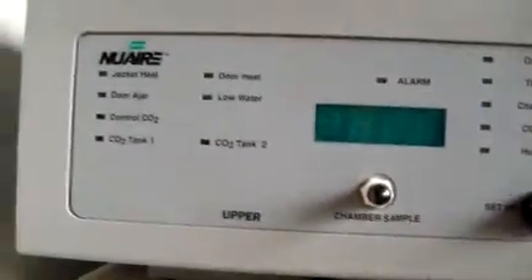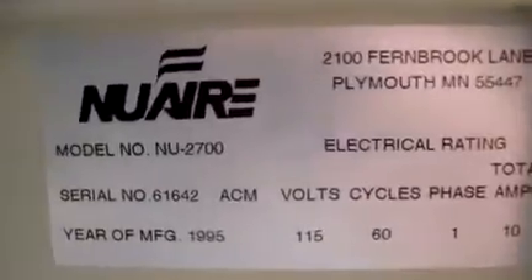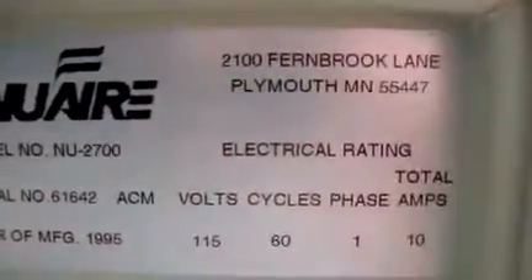Electronically, it is in good shape as far as the panels go. Date of manufacture is 1995, and it is an NU2700.